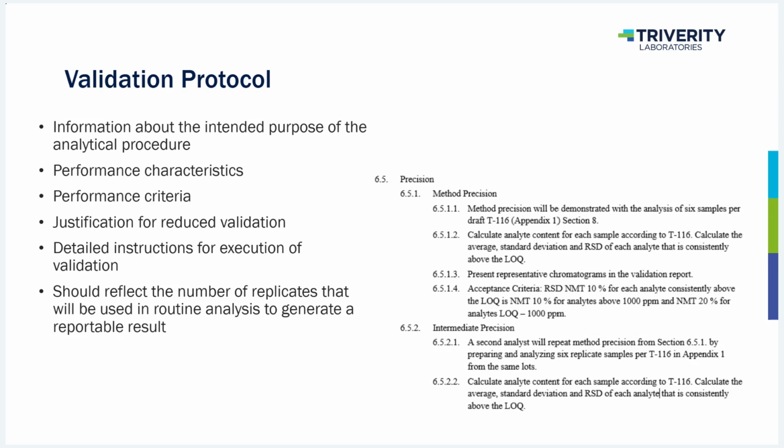If this was an accuracy section, we would be telling you how to make the spiking solutions. We would be telling you how to spike the samples. You want to be very specific so that the validation protocol can be executed easily.